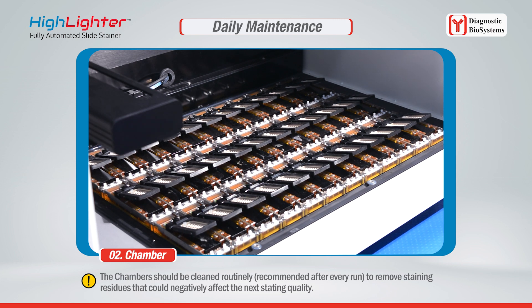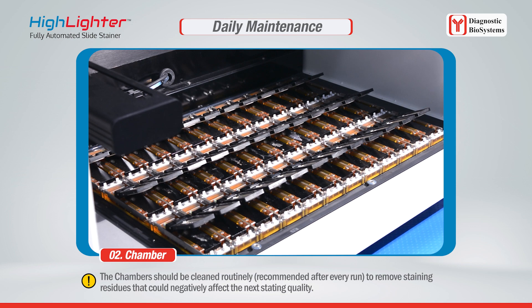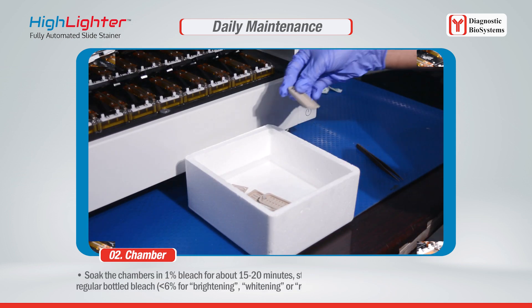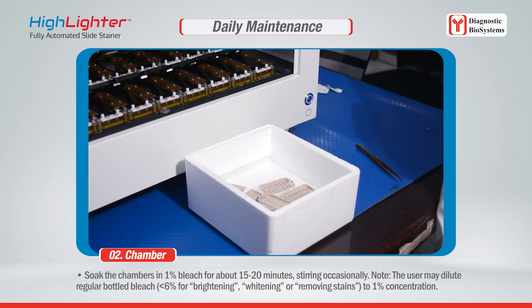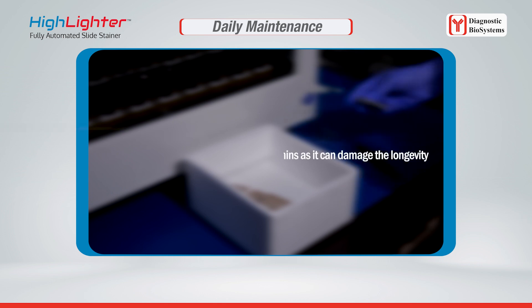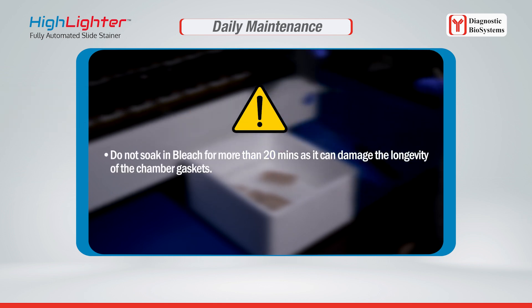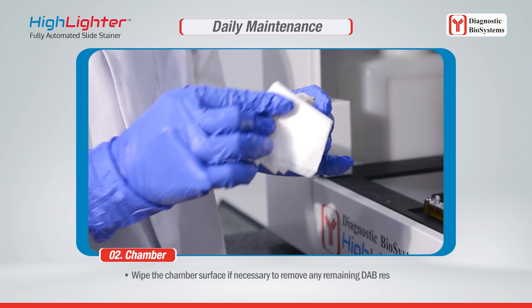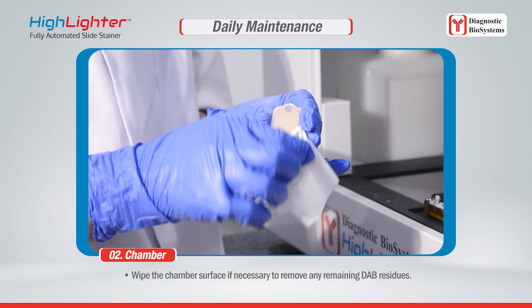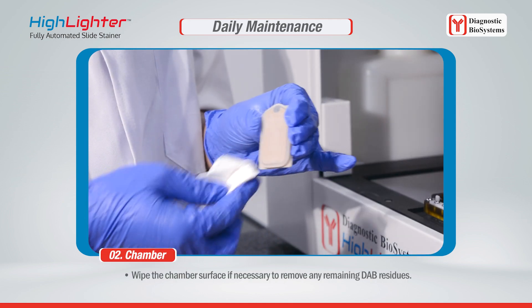The chambers should be cleaned routinely after every run to remove staining residues that could negatively affect the next staining quality. Soak the chambers in 1% bleach for about 15 to 20 minutes, stirring occasionally. The user may dilute regular bottled bleach (less than 6% for brightening, whitening, or removing stains) to 1% concentration. Do not soak in bleach for more than 20 minutes, as it can damage the longevity of the chamber gaskets.